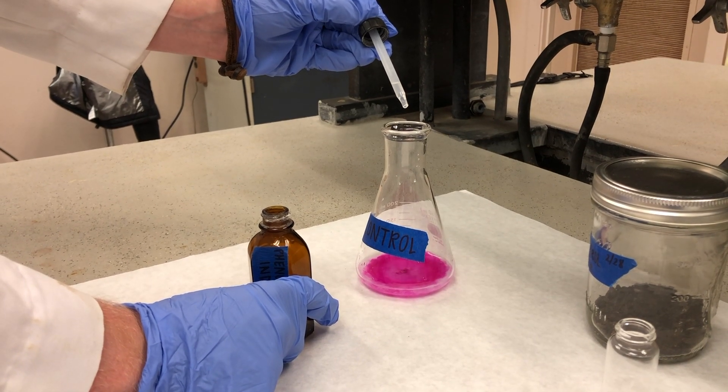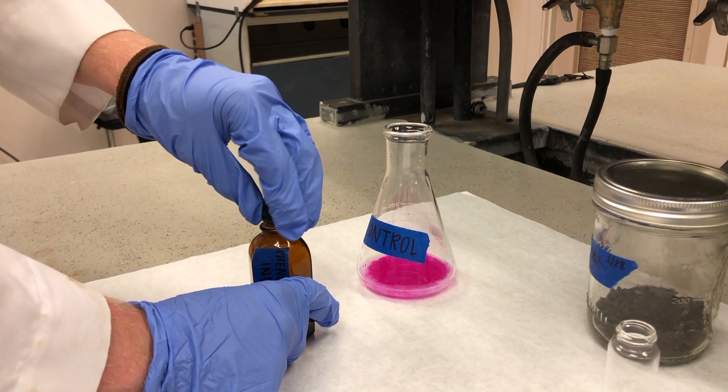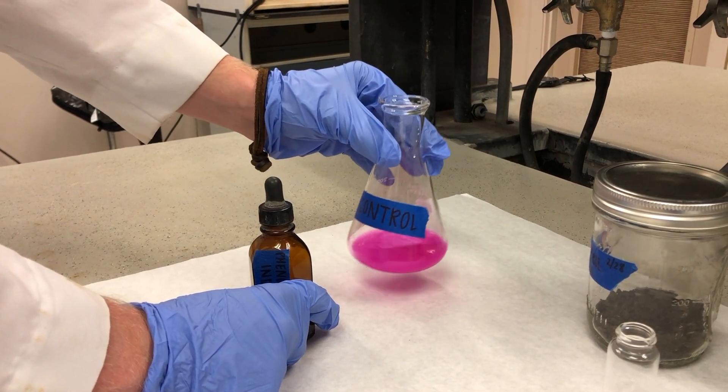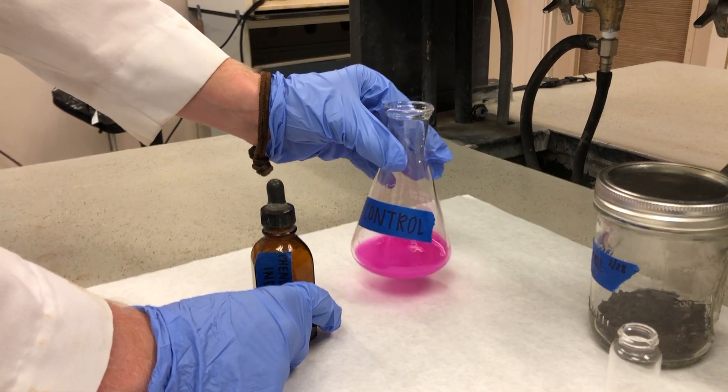Next, add 5 drops of phenolphthalein indicator to each flask. This will turn the solution bright pink to red. Swirl the contents of the flask to mix them.